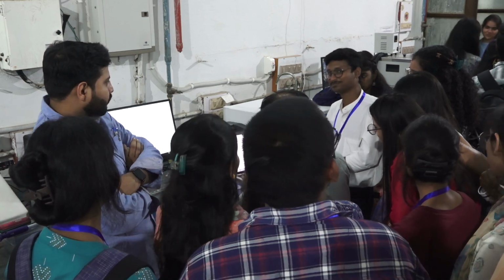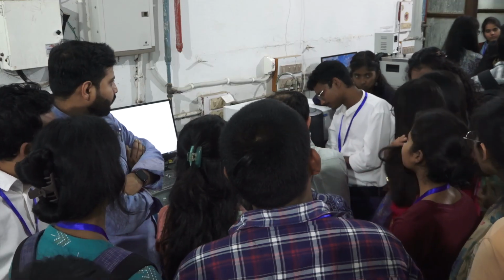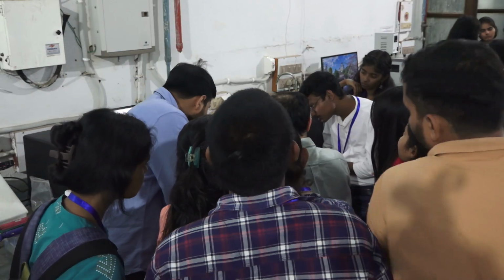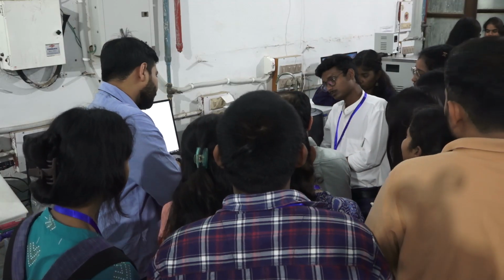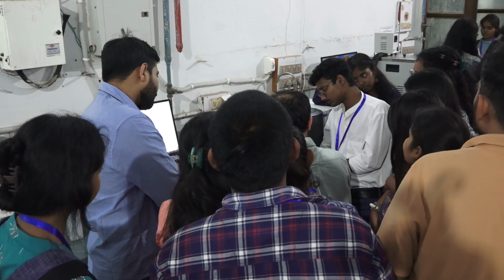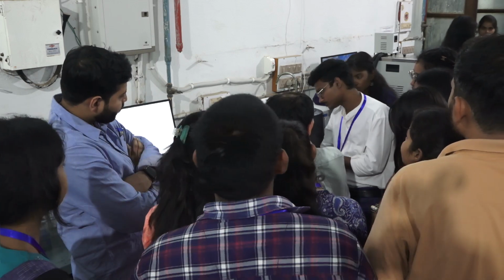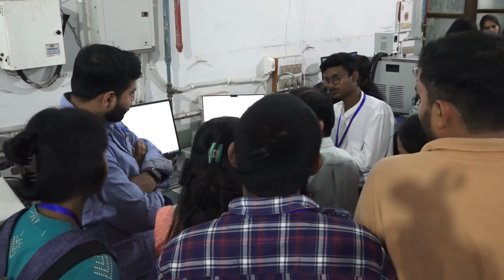This peak is 1064, and the right hand side is 991. Using the cursor and checking the peak position, you can identify the wave number.